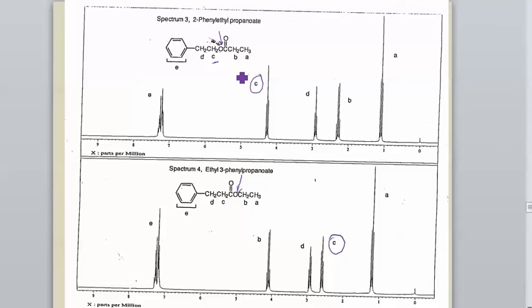And at the same time, the ones labeled B here, notice how that peak changes. Here's the hydrogens labeled as B in this top spectrum, and look at the corresponding hydrogens down below. We've gone from, again, a little over 2 parts per million to up here a little above 4. Because when we move that oxygen to the right side of that carbonyl, now that oxygen is very close to those hydrogens labeled as B here.